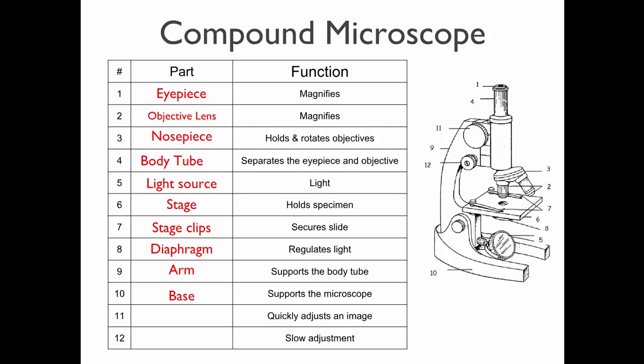The bottom of the microscope is called the base. The part that I'm holding on to right now is called the arm of the microscope. And then the most important parts, or two of the most important parts, are these knobs here.